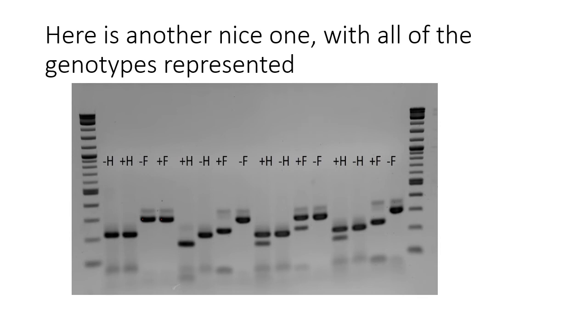The next set is a heterozygote, and so this is going to show us what happens when you've got one little t allele and one big T allele in the same genome. Again, we've got the plus H and the minus. If you look at the minus, that's the 221 base pair product. And when it's treated with the enzyme, you get, again, a 221 base pair product, but you also get a smaller one, which is 177 base pairs, indicating that the site was present and cut.